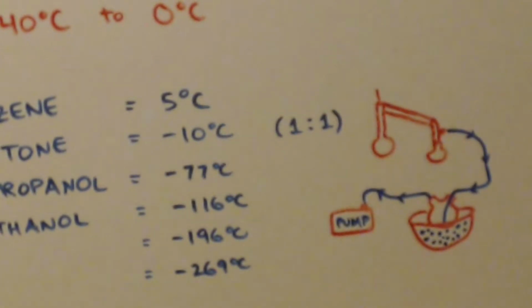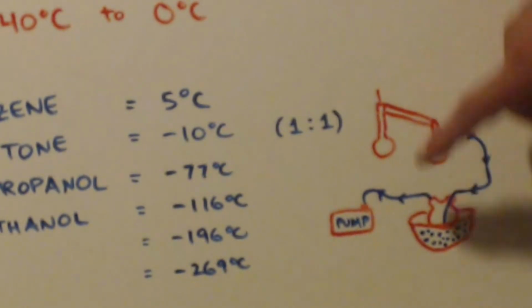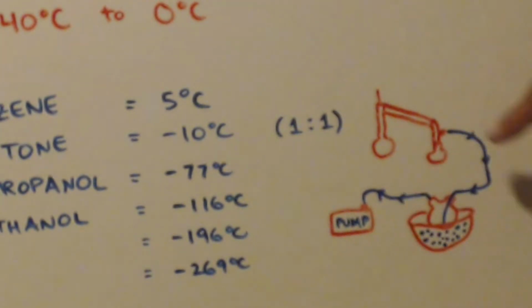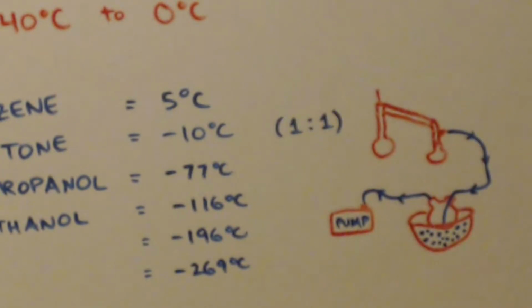Now, another thing you can use it for, so let's say you have a distillation setup like this and you have a vacuum pump, right? The hose comes to the pump and you pump it out. And that stuff, it just pumps it into the air unless you have a fume hood or whatever, or you can lead it outside.